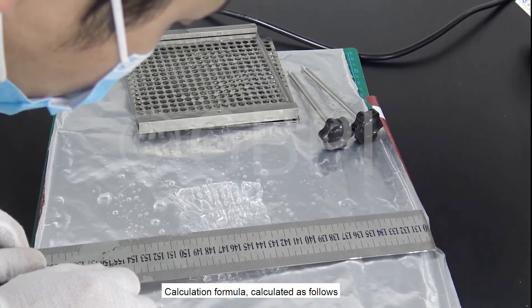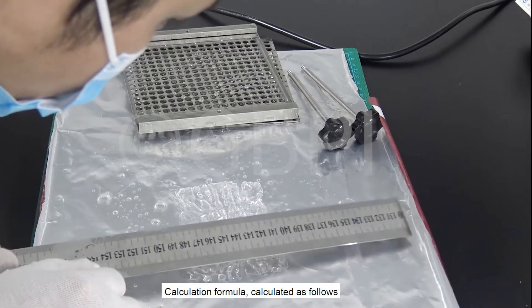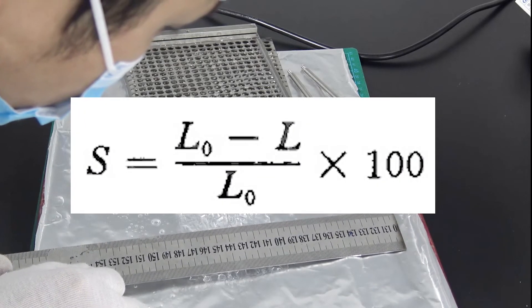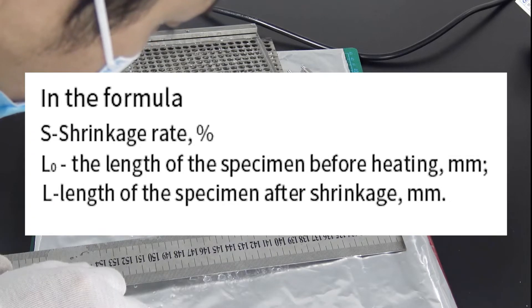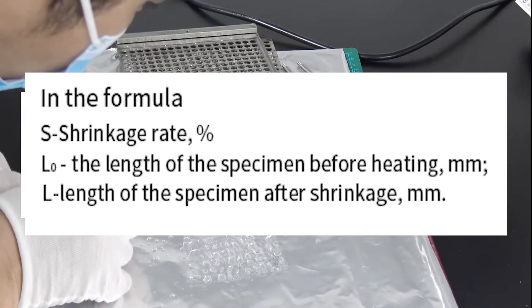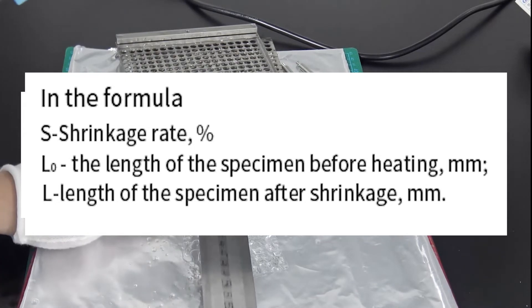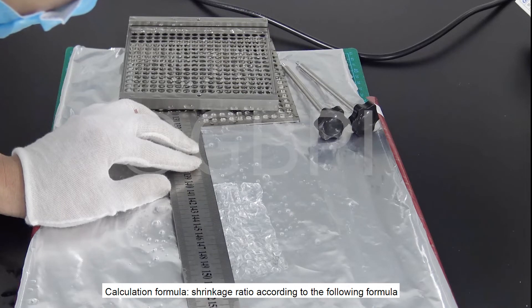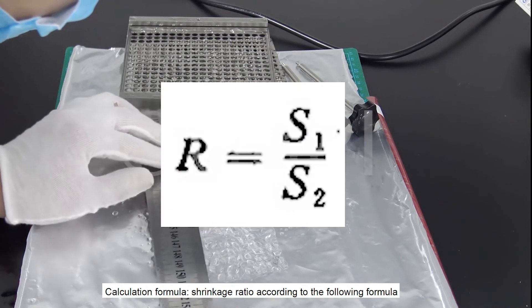Calculate the shrinkage ratio according to the following formula.